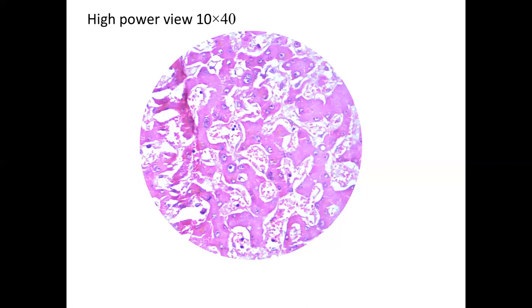Moving to a high power view of the same liver slide (10x40), you can now very clearly see the nuclei. Inside the nucleus, you can see chromatin as well as the nucleolus. The pink area surrounding the nucleus is the cytoplasm, so the cell margin would be somewhat like that — a central nucleus with cytoplasm surrounding it and a visible nucleolus. The sinusoids are also clearly seen here, and you can see individual red blood cells.